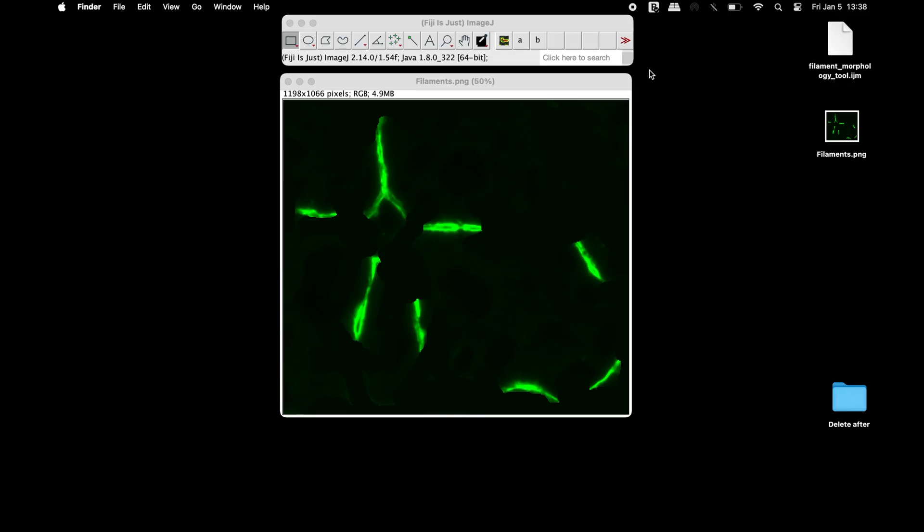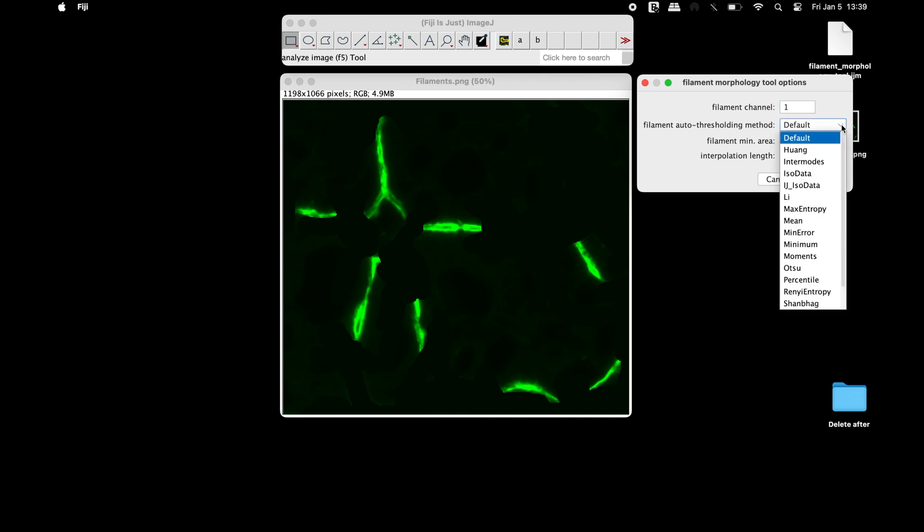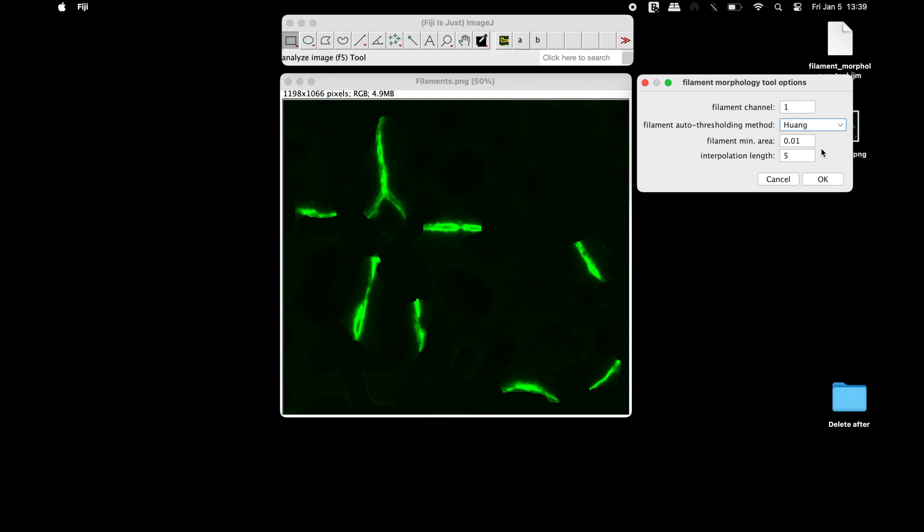To analyze the filament morphology, make a right click on the second icon, A. Set 1 to specify the channel having the filament image from a single channel color. Select the appropriate auto thresholding method according to the type of image.